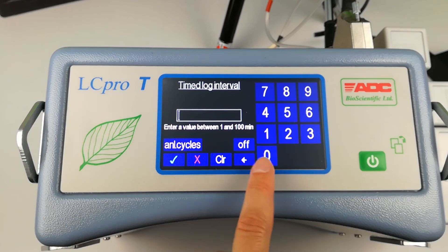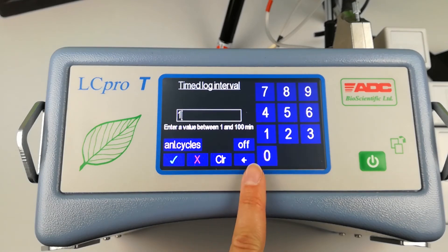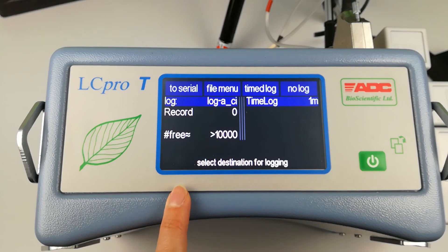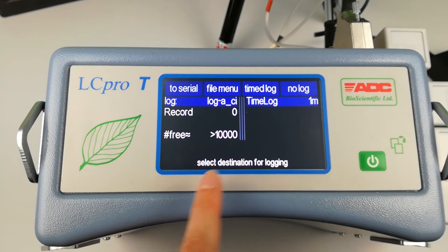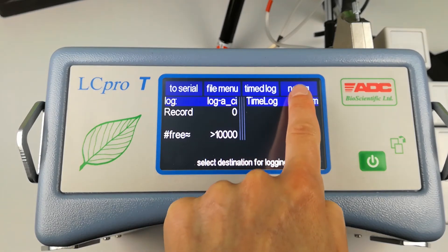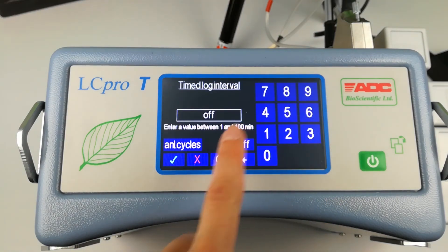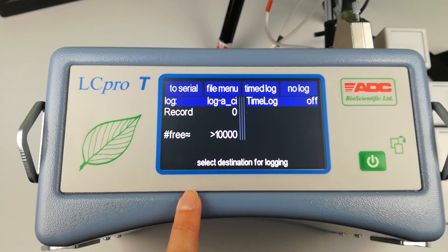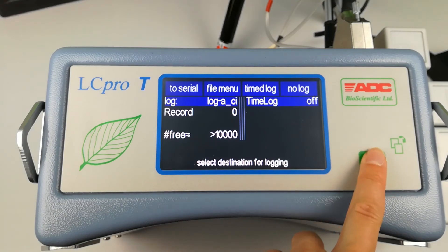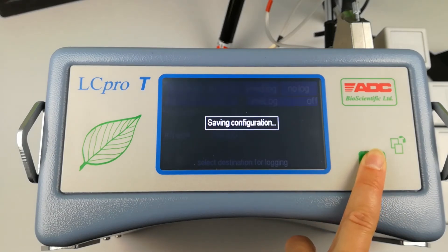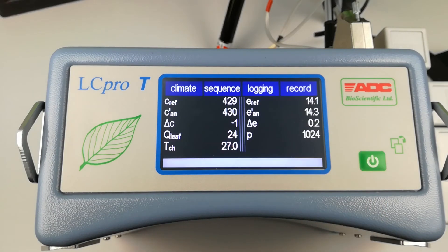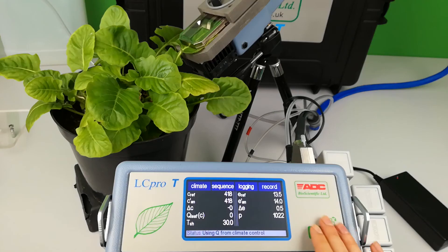Alternatively, press the green power button twice to return to main menu 1. Automatic logging will now take place. Or, if you touch no log, automatic logging will be removed but a data log file is still live. This is the file name that you created.